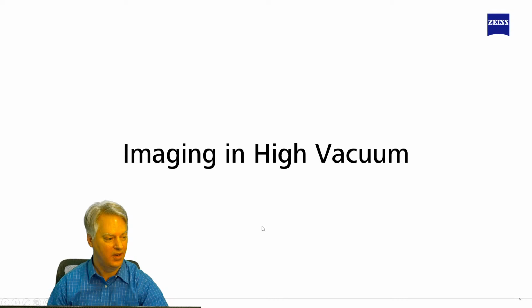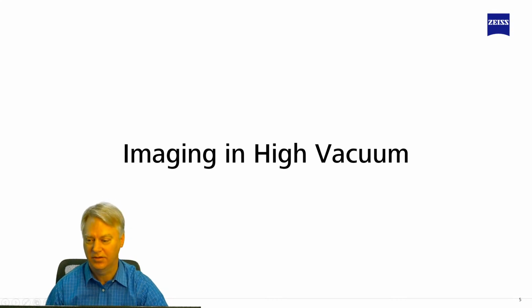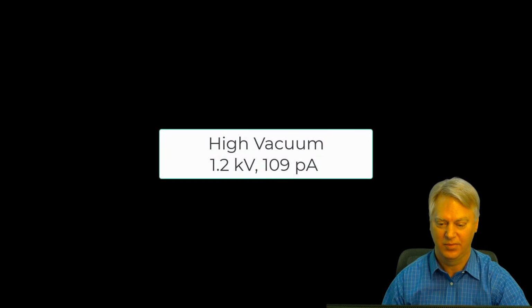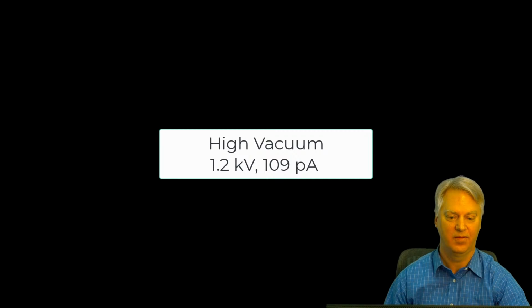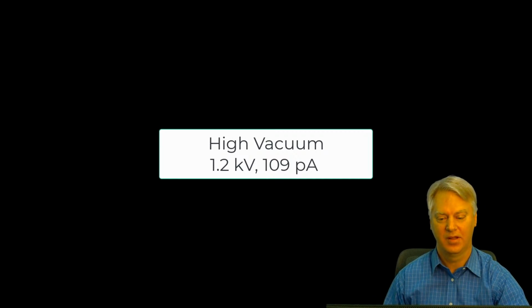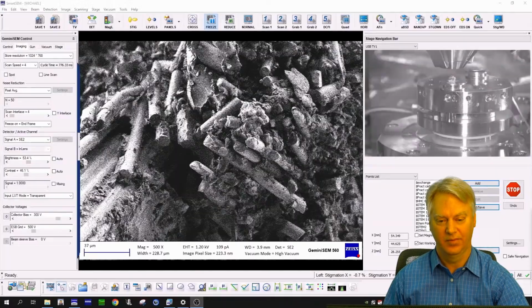I'm going to switch back to the video where I've recorded different segments. I'm on the Gemini SEM 560 for all this. I'm going to start initially with high vacuum, 1.2 kV, 109 picoamp. Let's give it a moment here.